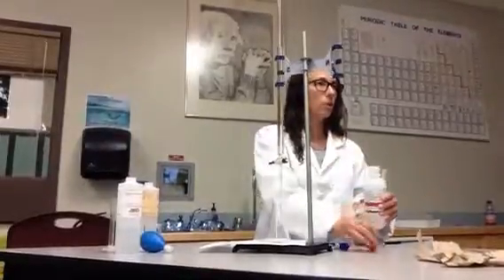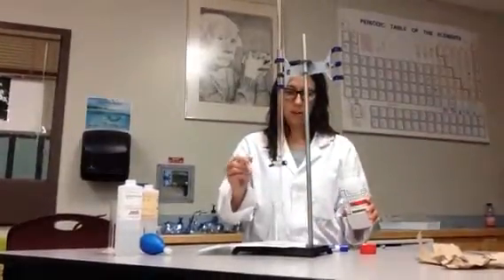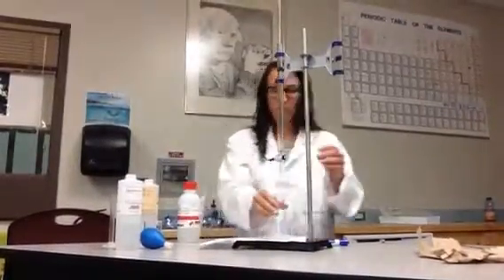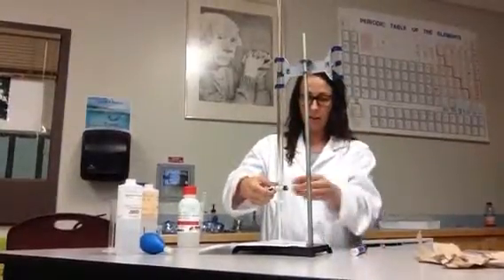This is phenolphthalein. Do you remember us doing a whole bunch of work on indicators? Right, so phenolphthalein is colorless in an acid and pink in a base. So I'm going to start adding this until I get it to turn pink.